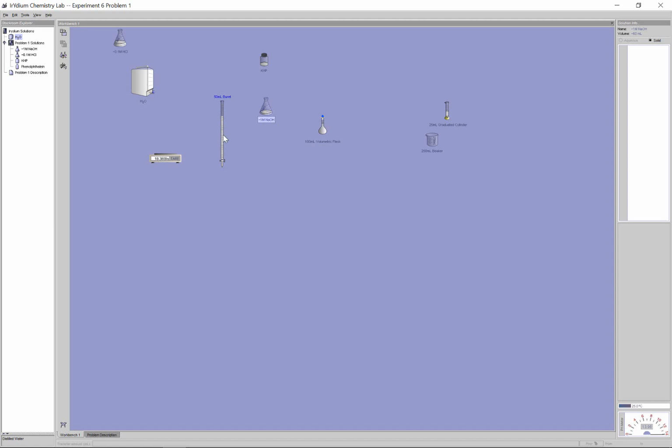So that's going to be my base solution. I'm going to have my acidic standard here ready. I have 100 mils, so I have more than enough that I need. Usually what we have is just pulling out an Erlenmeyer on the bottom here. I'm just going to pull out a couple of these Erlenmeyers because, again, in the titration I want to do multiple trials just to make sure it's reproducible. So I'm going to have these three here.